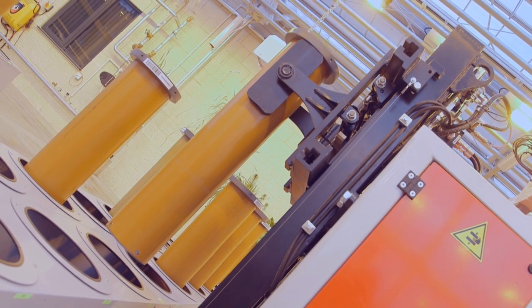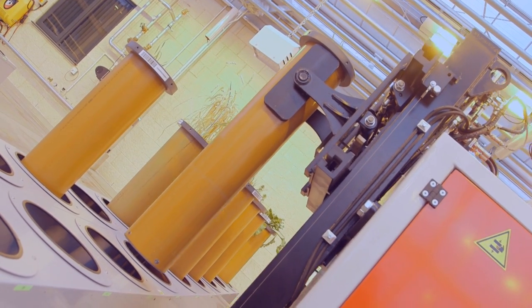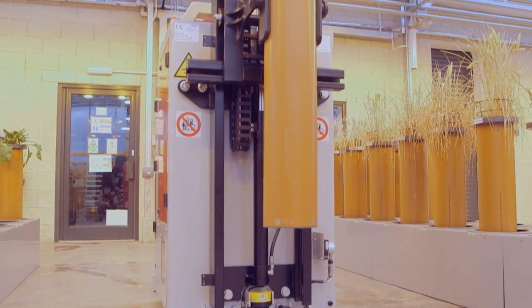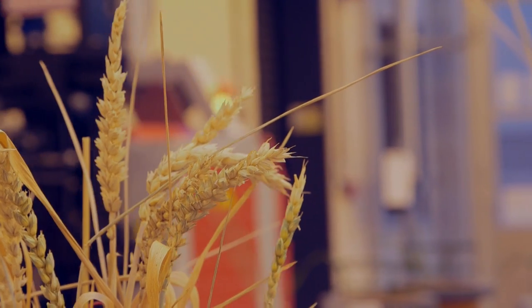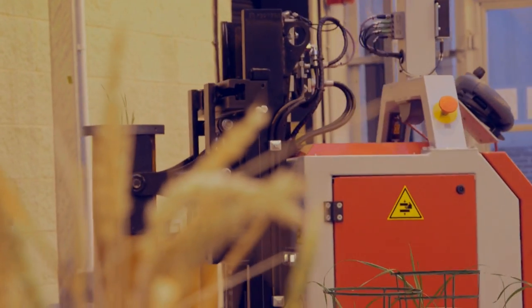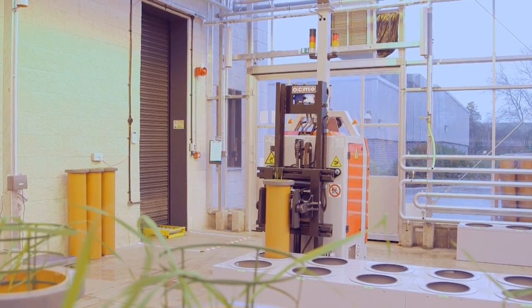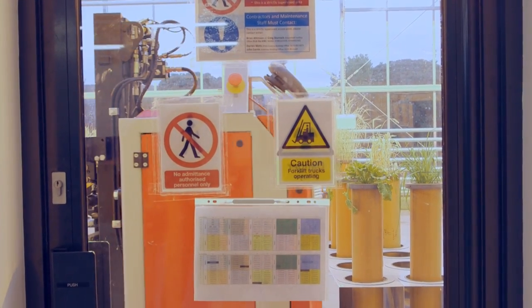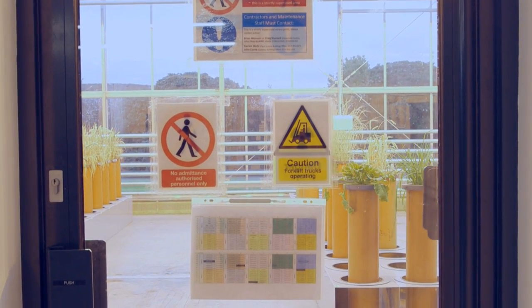These robots are sometimes used in hospitals to carry big baskets of food around or laundry. The nonstandard part of this facility is the analysis of the images to pull out the root structures. Biologists and plant scientists in particular are looking at producing varieties of plants that will grow in the conditions that we are currently facing — water has moved around, some areas are much wetter than they used to be, some are much drier. It's getting hard to produce plants that will live in those conditions and produce enough food. The biologists understand the genetic structure of the plants fairly well, but to produce a food supply they need to relate the genetic structure of the plants to the physical — that's called the phenotype.